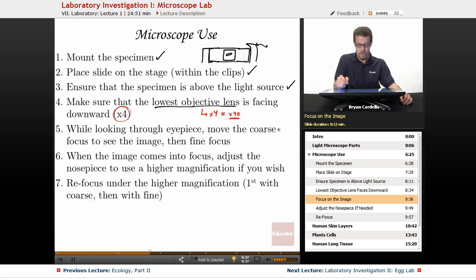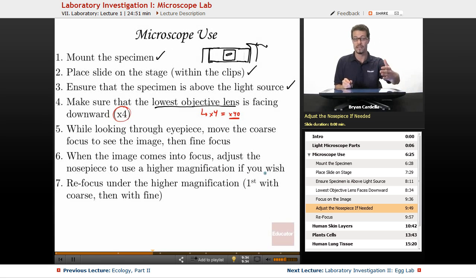While looking through the eyepiece, move the coarse focus to see the image, then the fine focus. You want to start with that coarse focus. That's the one that moves the stage up and down. Then when it's nice and crisp, then move the fine. When the image comes into focus, adjust the nose piece to use a higher magnification if you wish. You can then move to the times 10, to the times 40, and refocus under that higher magnification.